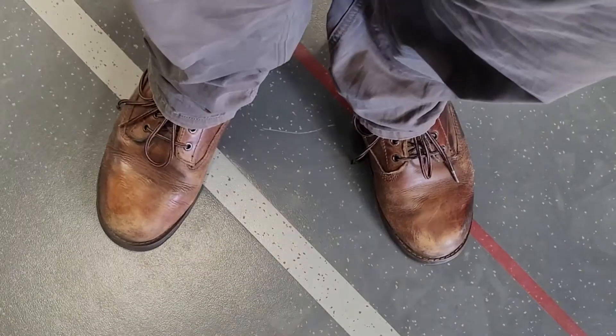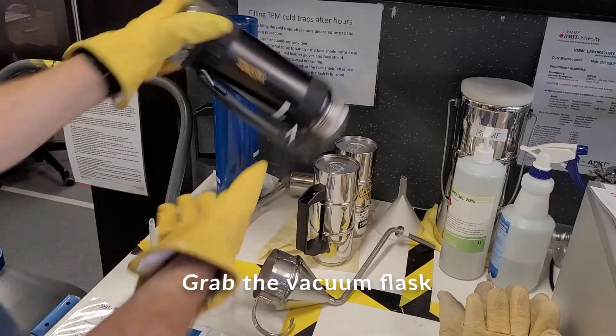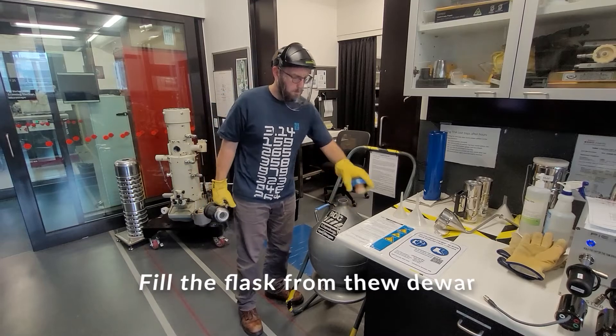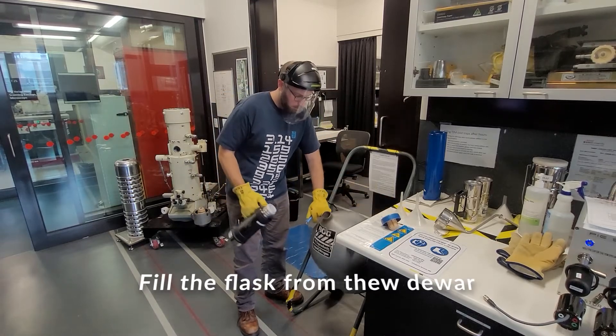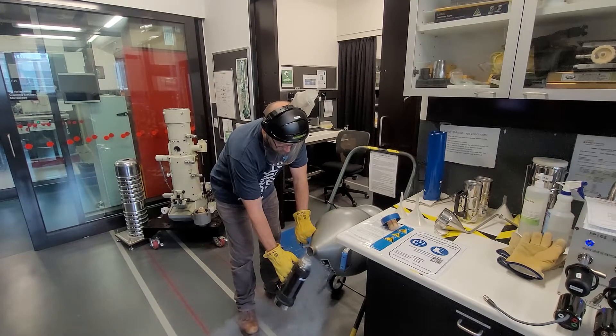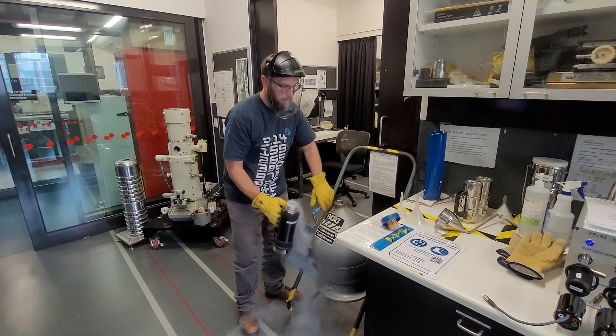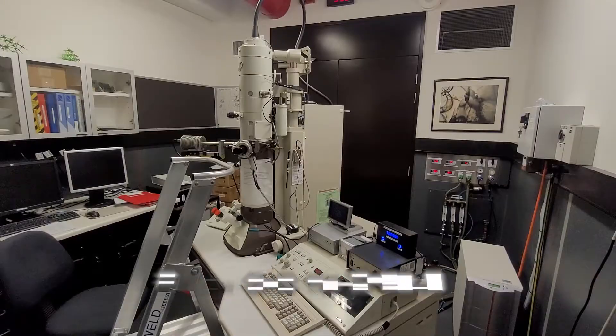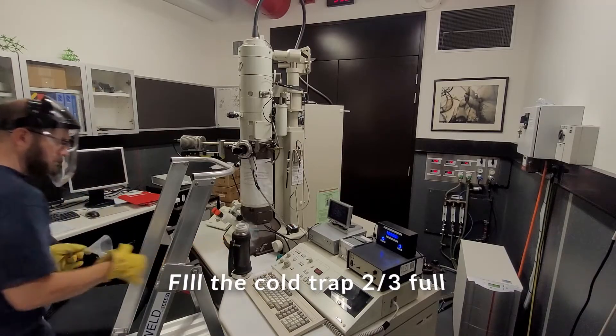Leather shoes are highly recommended. Grab a vacuum flask and seat it securely in your hand. Remove the cap and stand beside the dewar to fill the vacuum flask with liquid nitrogen. Replace the cap and grab the large funnel. Place the flask on the bench, then climb the ladder.